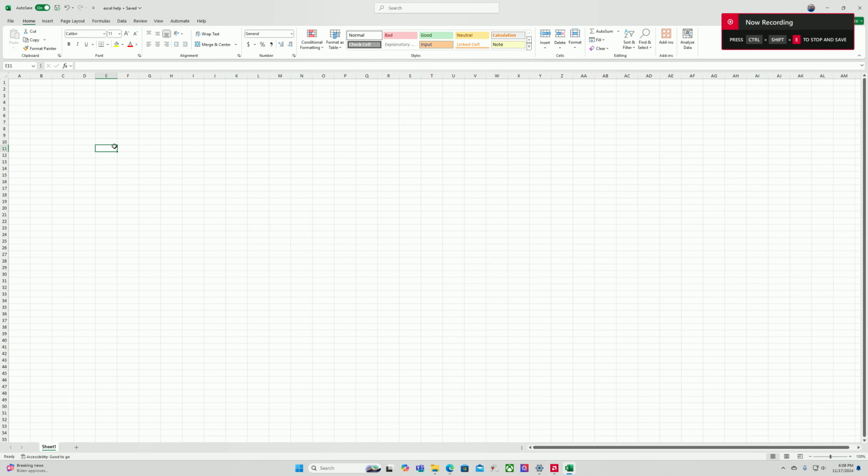All right, so I wanted to do a quick little rundown of Excel for those of you who haven't used it or it's been a while since you have used it. So just kind of wanted to show you what I like to see from Excel documents and what I like to see from graphs. So what I'm going to do is I'm just going to get into Excel.